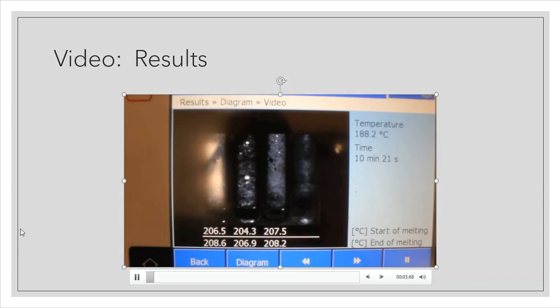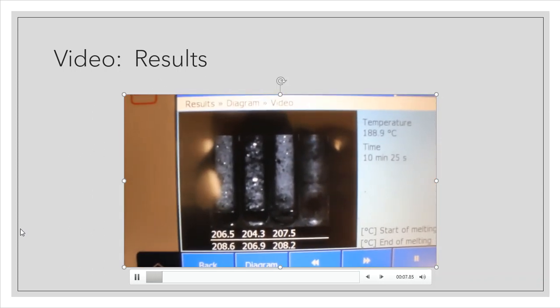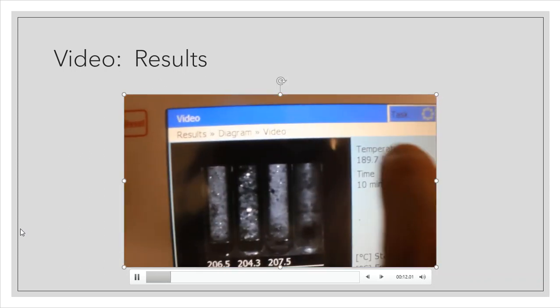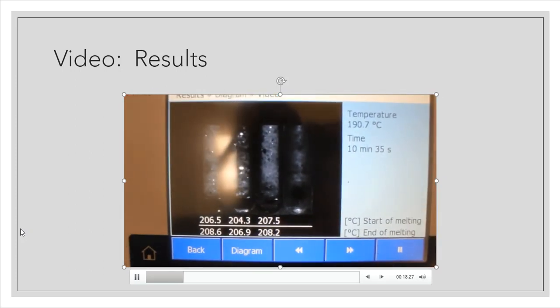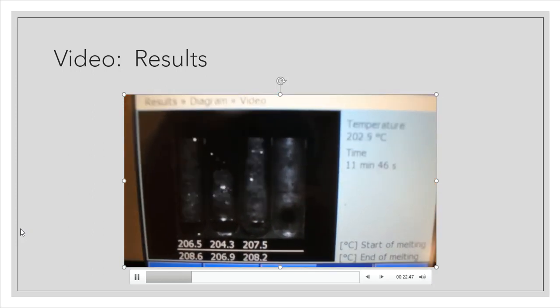So what you're seeing here is after the fact. It's after I have already analyzed them. I just wanted you to see when the crystals actually do melt and compare it to the temperature that's going to be up here on the top right-hand side. So this machine is going to start analyzing it. I'm going to start fast-forwarding it so we don't have to wait here forever.